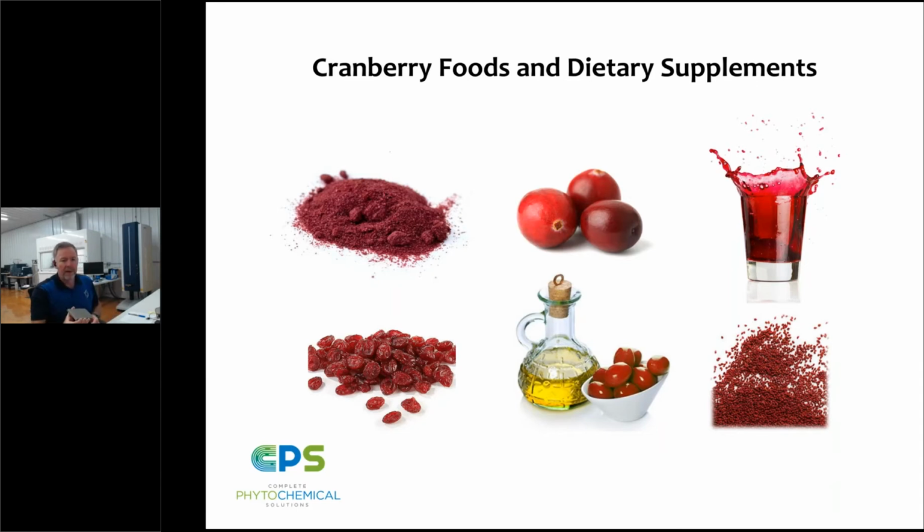So what I want to do is introduce this now to the instrument, and while the instrument is loading the stainless steel target, we can give some other demonstrations of cranberry products in the marketplace. So this is as simple as placing the target on an extractable arm that's in the instrument. The arm is now going to retract into the instrument itself. There's going to be a vacuum that is pulled on the instrument, and soon we'll be able to analyze the little spots, the combination of the matrix and the analyte that were placed on the target.